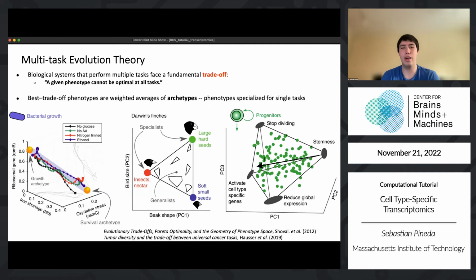All of these methods look at the average profile of each cluster, and then do things like annotation based on that. Well, when we want to find very rare cell types, this doesn't work very well.